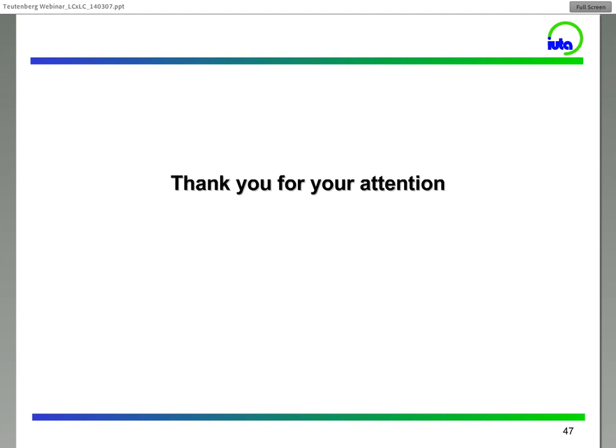In effect, this is really a problem if you would like to make a comparison between a 1D approach and a 2D LC approach. So let me elaborate on this, because I think this is very important. If you look at some talks about LC times LC, the question about the sample volume or injection volume which will be introduced on your system is almost never answered.